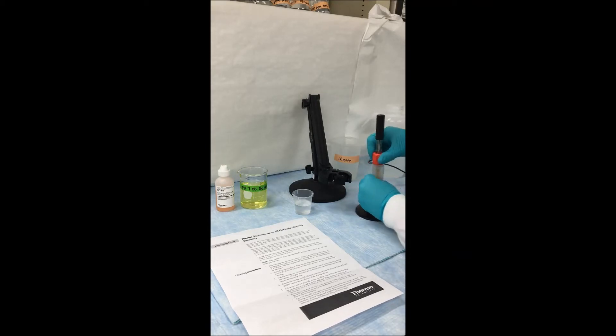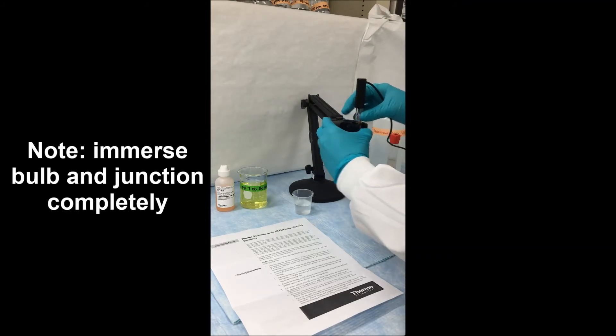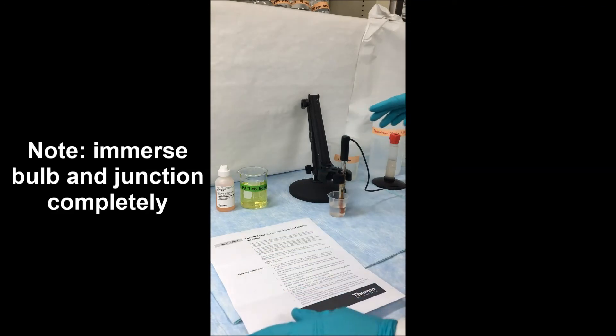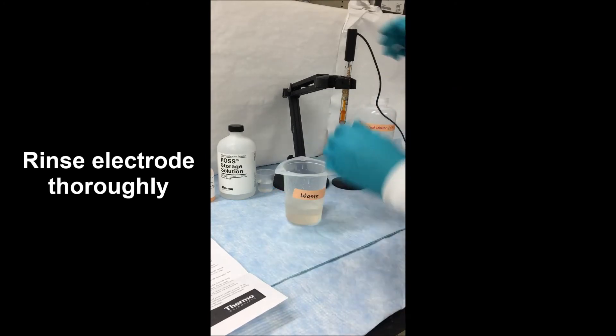Next, we remove our electrode from the storage container, making sure not to create a vacuum, and allow that electrode to sit inside of the cleaner solution for as long as we deem necessary. This can be anywhere from a minute up to 30 minutes. Using a stand to hold the electrode upright, we want to make sure that the whole junction is submerged inside of the cleaning solution. After waiting the appropriate amount of time, you want to remove the electrode from the cleaning solution and rinse it thoroughly to make sure you remove all of the cleaning solution.